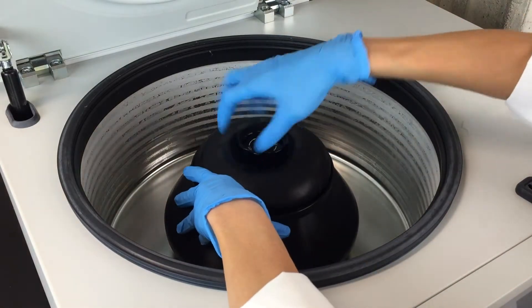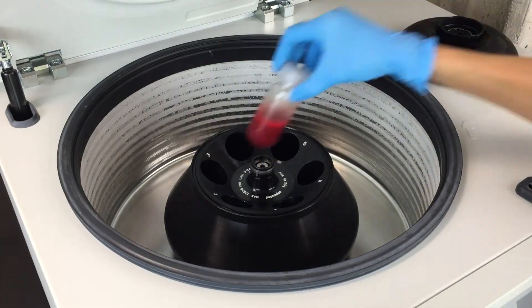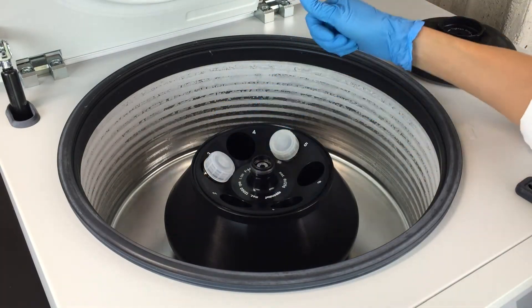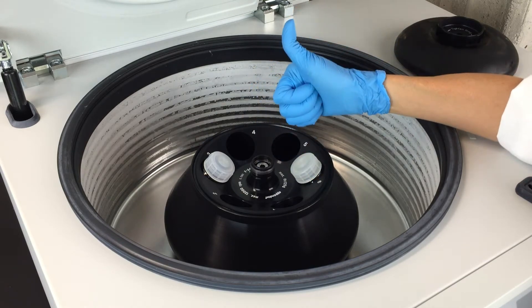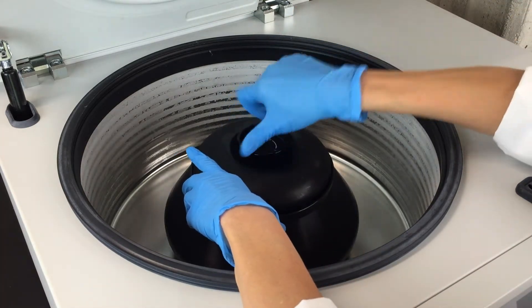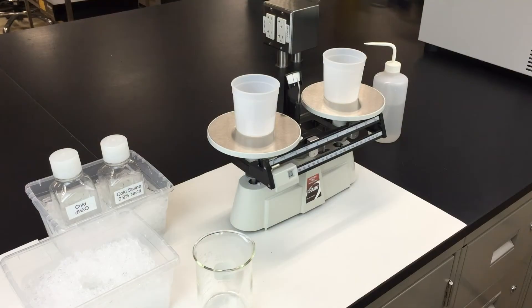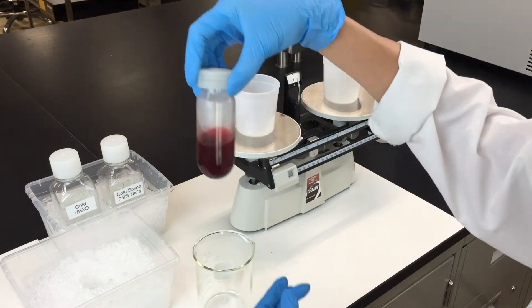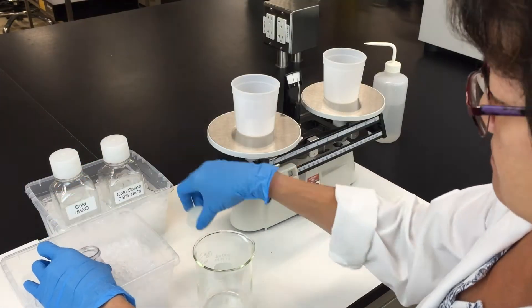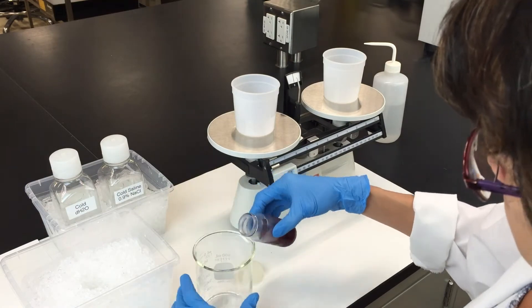Centrifuging isolates the red blood cells in a pellet at the bottom. Place the tubes opposite each other in the rotor to balance them. If you don't, it could damage the centrifuge. After the first spin, you want to pour off the liquid layer and keep the pellet.